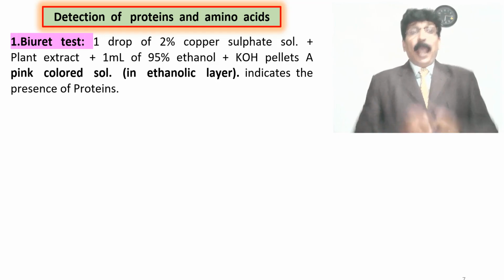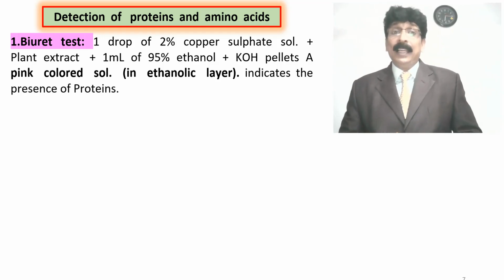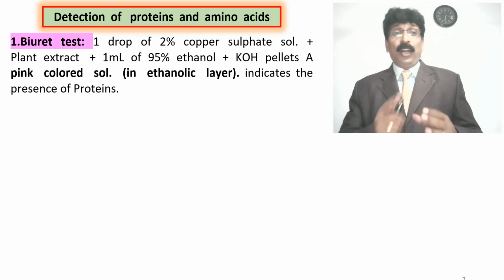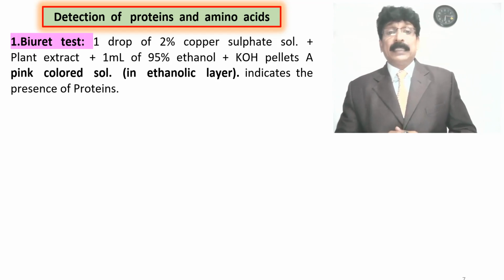A pink colored solution is formed in the ethanolic layer. You will get a pink color in the ethanolic layer, which indicates the presence of proteins.